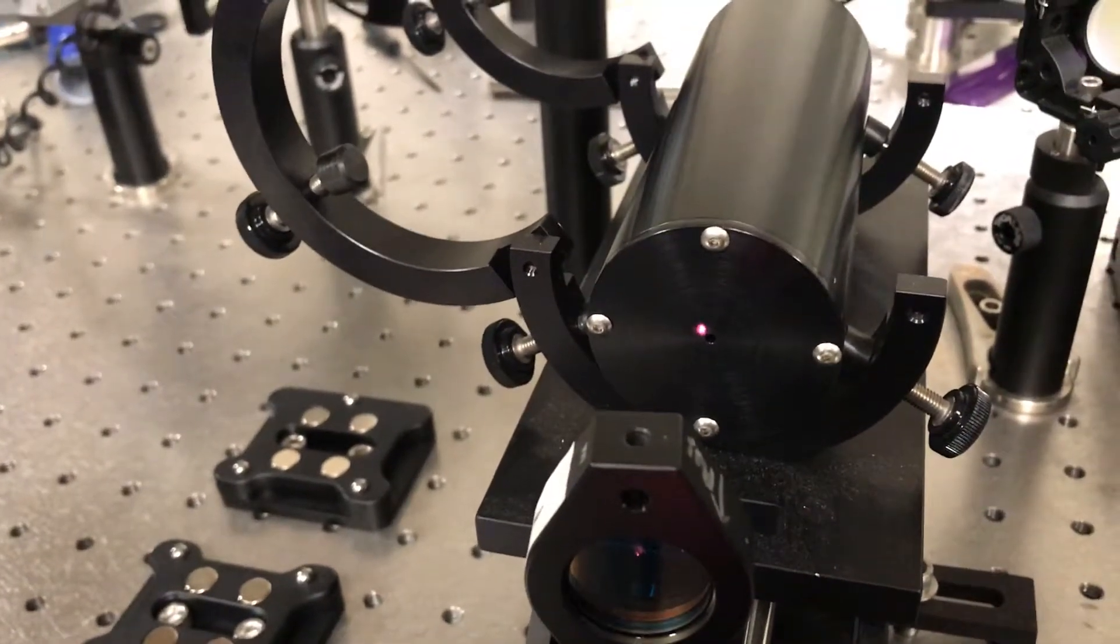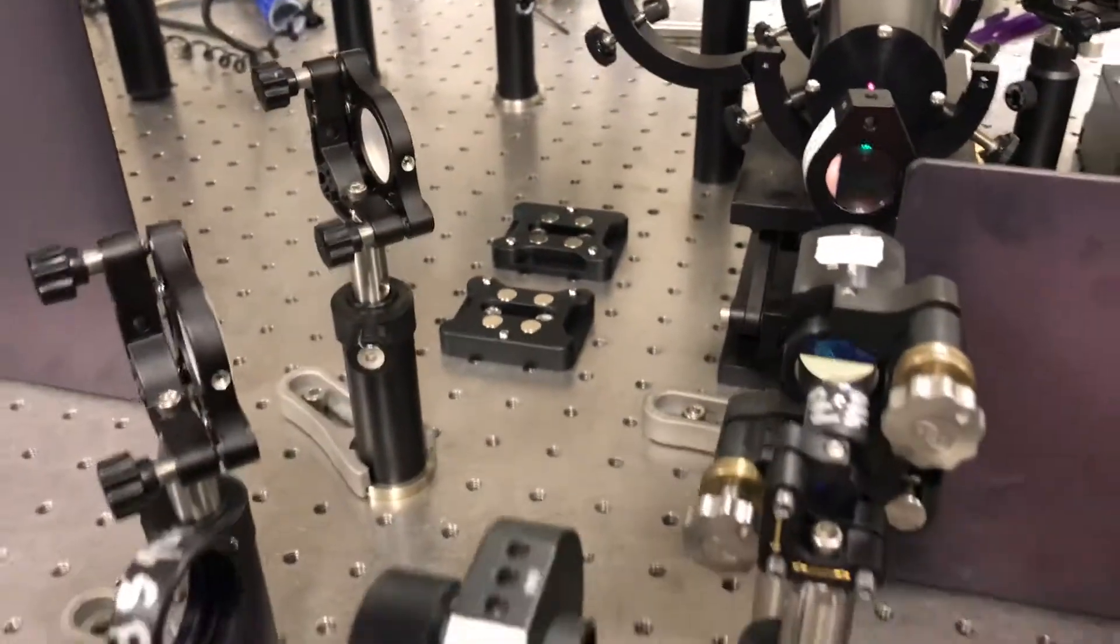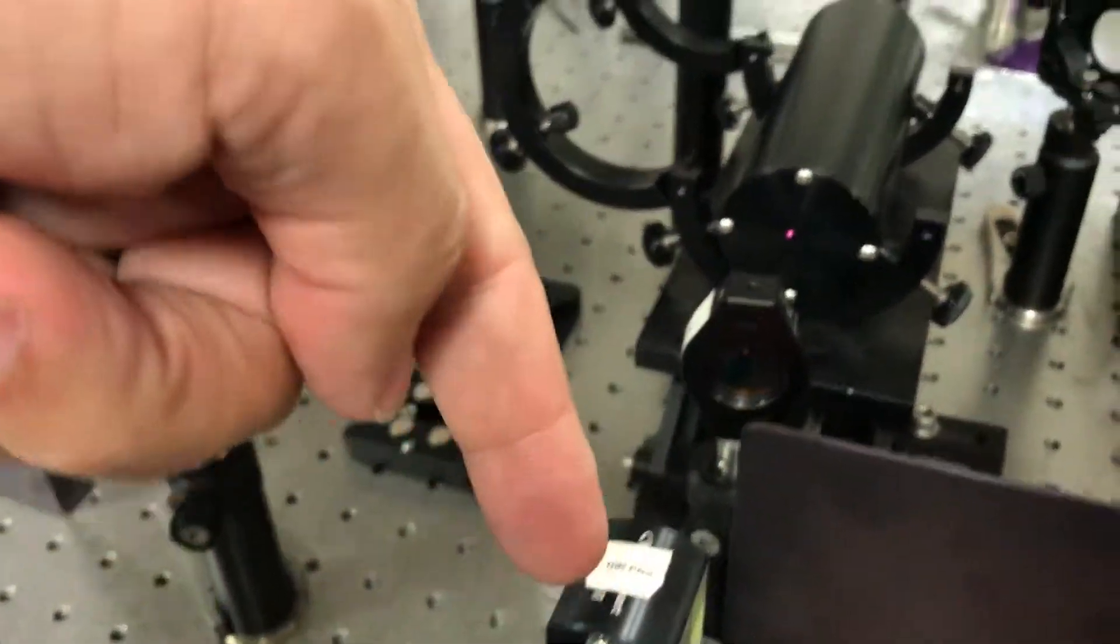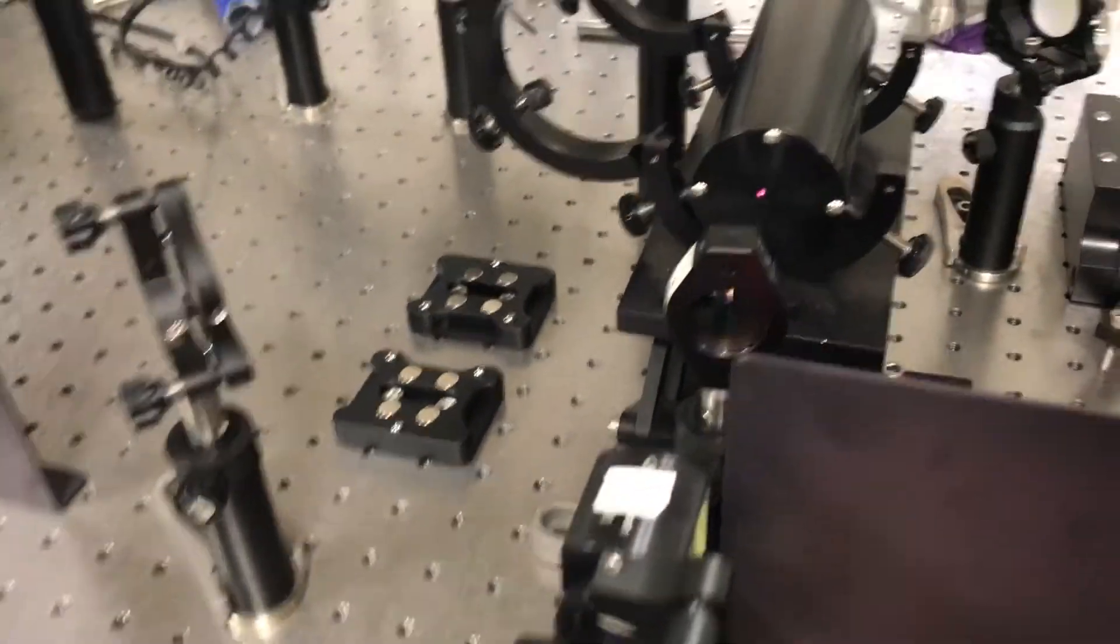Now, what you don't want to do is redo what you just did. So we already have this polarizing beam splitter set up so that the laser goes directly down the line of the table. We don't want to mess that up.